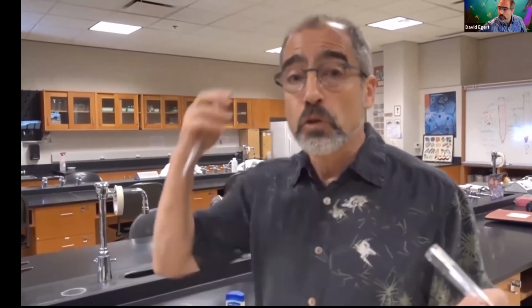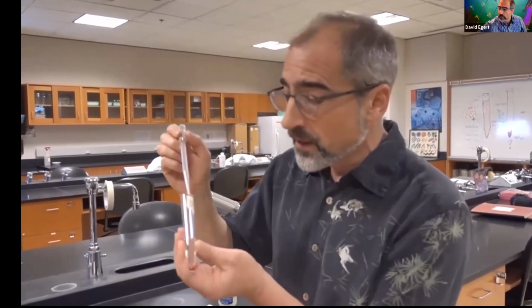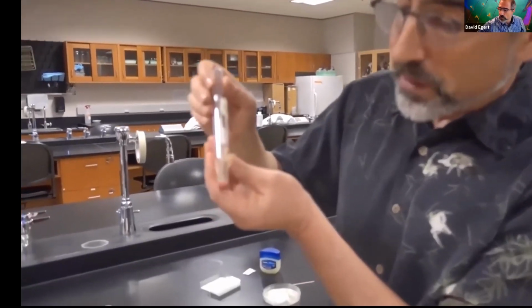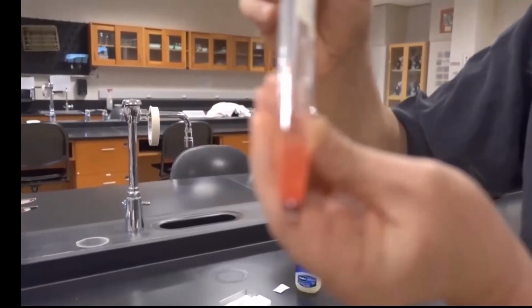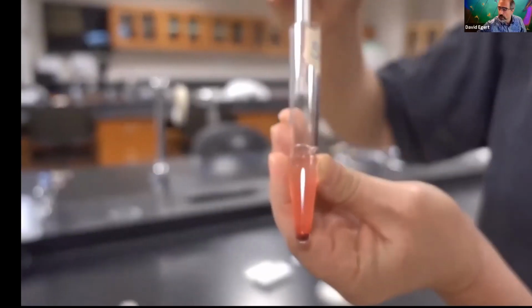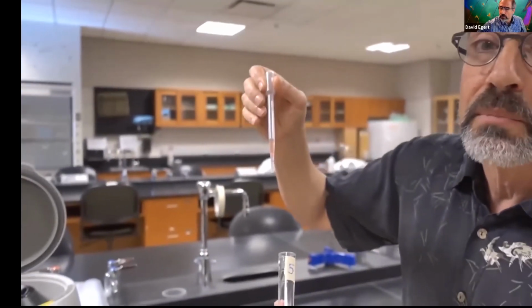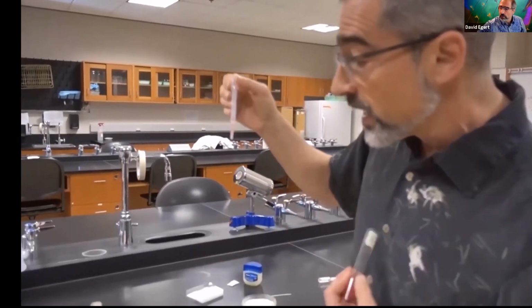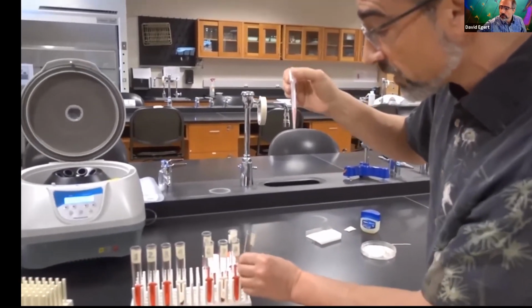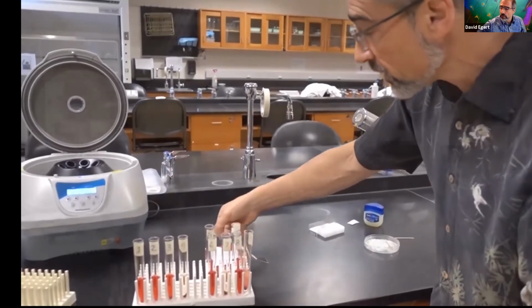And a few of them. So don't get too ambitious about resuspending them. You just kind of swirl them back up in the solution there, and then you can grab them up, but you really want it to be pretty darn dilute, or else it's going to be really hard to see any individual cells. And then we want to actually create the slide.